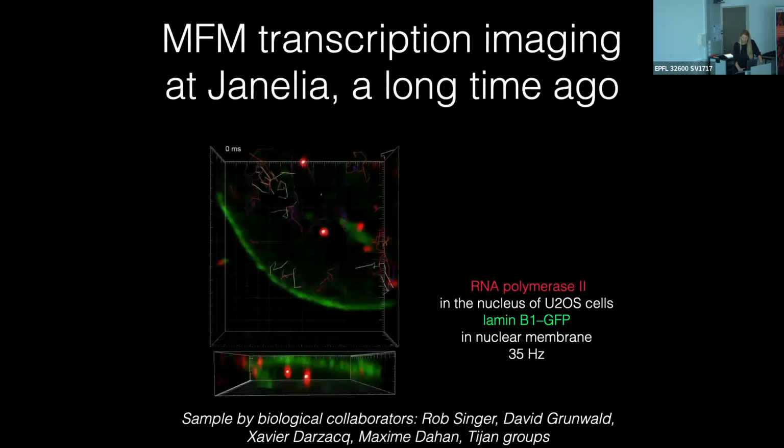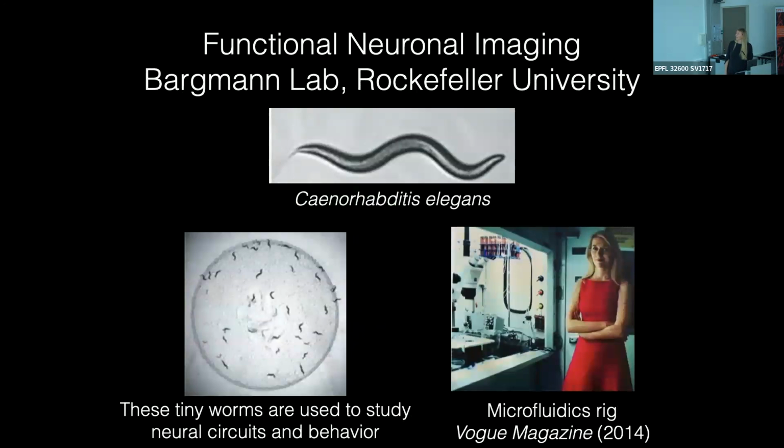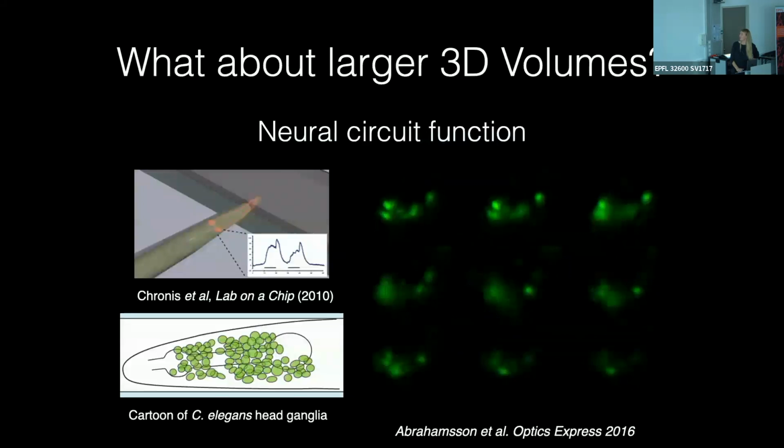So then, we've been looking at these tiny things like the cell nucleus, 9 focal planes. Actually, the grading you have there, it even has only 7 spots, because one of my collaborators said, Sarah, this is a waste of photons. My first and my last plane, they have nothing in them. Can you make just 7 planes? So we made just 7 planes. But when I got to Corey's lab, the problem was another one, and that was that they're looking at animals. They're small animals, but they're much bigger than the cell nucleus. So the idea here was that we would try to make one of these microscopes with many more focal planes.